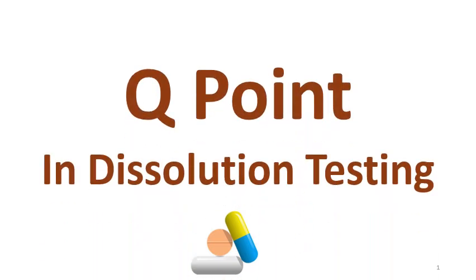Welcome dear viewers to the video on Q point in dissolution testing. In this video we are going to learn about the Q point. What is Q point? What are the requirements for Q point? And how the Q point is set for dissolution testing.